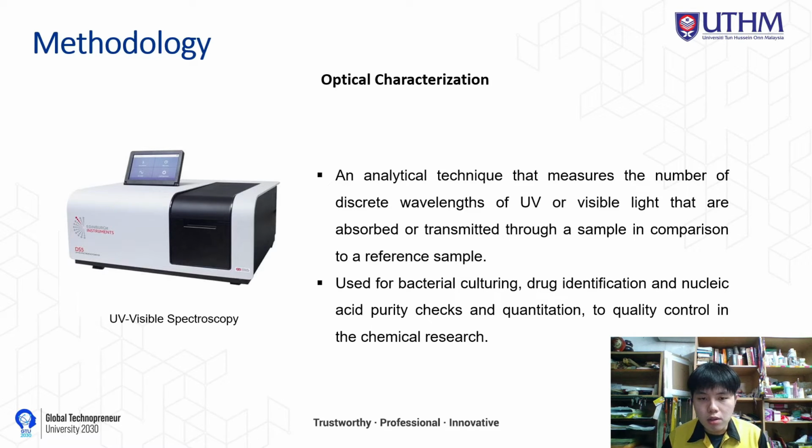It is mostly used for bacterial culturing, drug identification, and nucleic acid purity checks and quantification. It is also used for quality control in chemical research.